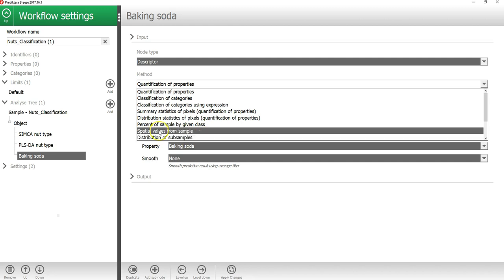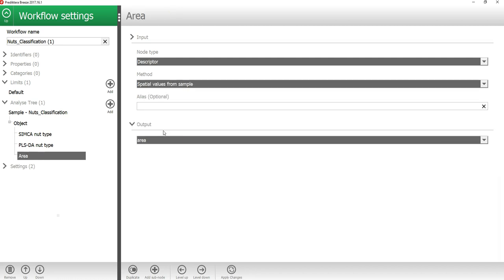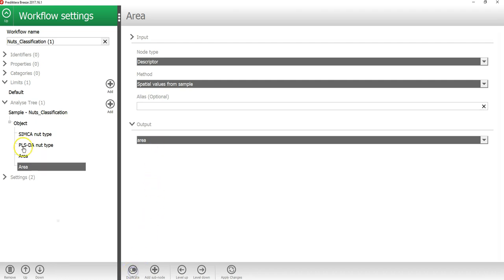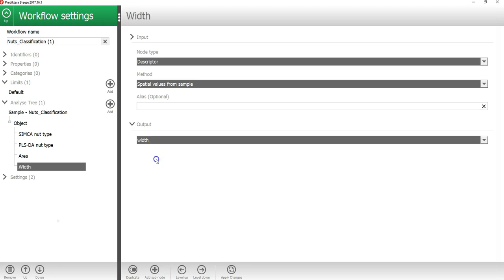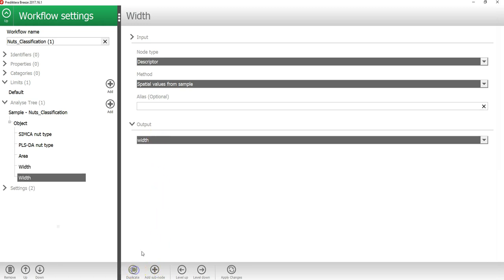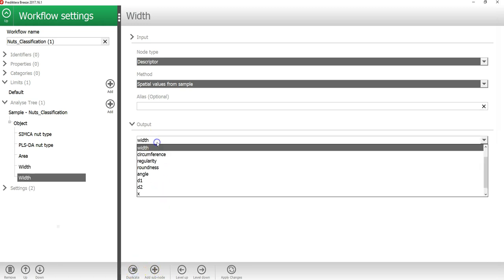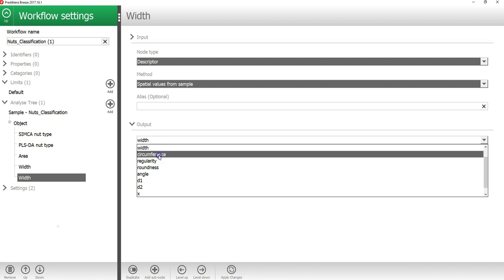In this example, I will show you how to add a descriptor called spatial values from sample. By default, this output is calculating the surface area for each object. If I press duplicate, it then adds additional descriptors. I will here add the width and I will press duplicate again. I will add the circumference.